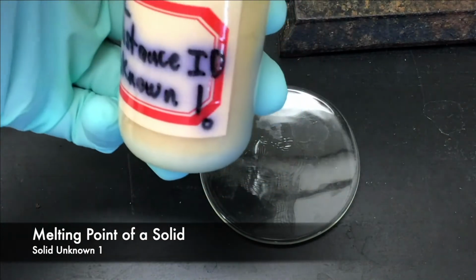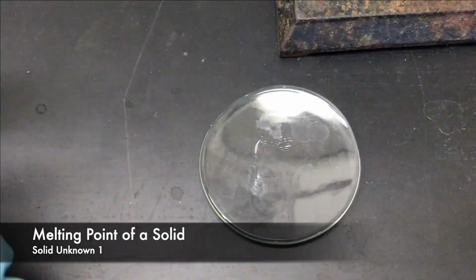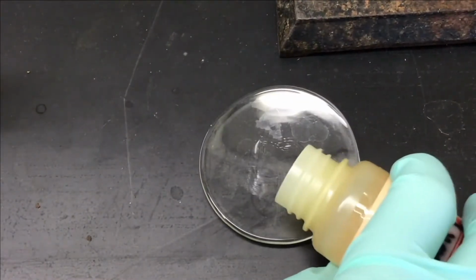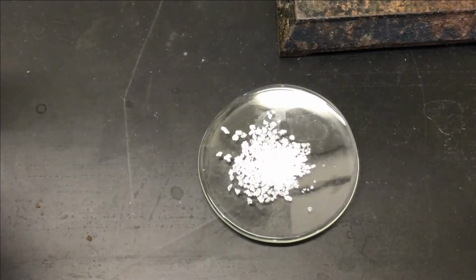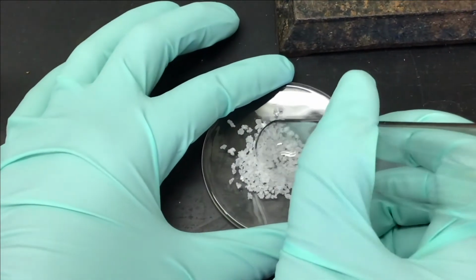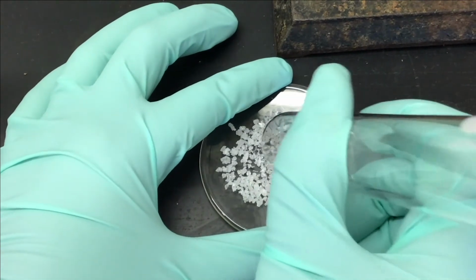Moving on to part C, we're going to find the melting point of our unknown solid. We're going to add a little bit of our unknown solid 1 to a clean, dry watch glass. And then using the bottom of a test tube that is also clean and dry, we're going to gently crush our crystals.